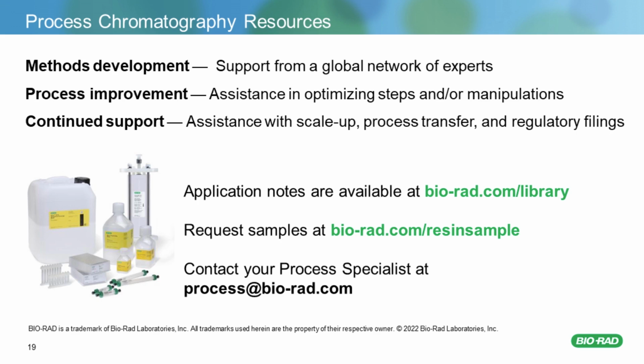Okay, great. As a reminder to our audience, you can go ahead and type in your questions for our speaker now. So our first question is, would you be able to use the Nuvia HP-Q for oligos that are larger than 20 mers?